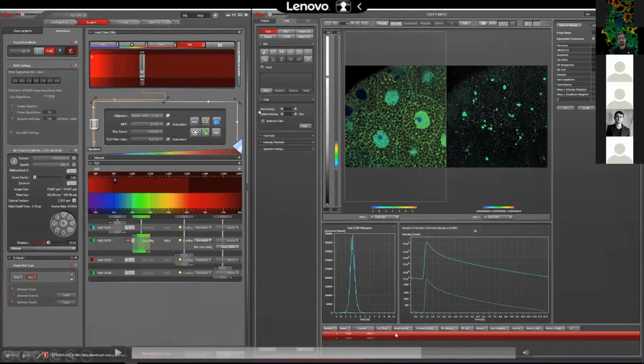Or in the analysis I can use pixel binning, and in that case I would get a better number of counts per pixel. That's exactly true. It might be necessary from time to time to use these options. However, as I said, we have done this mainly for the NADH analysis, and the FAD was the bonus. We wanted to see how the FLIRR ratio looked. That was really interesting for us as well.